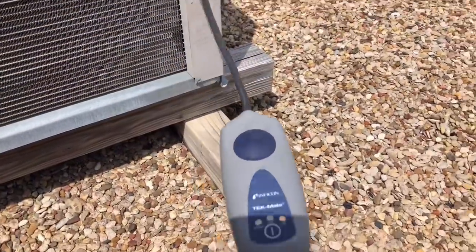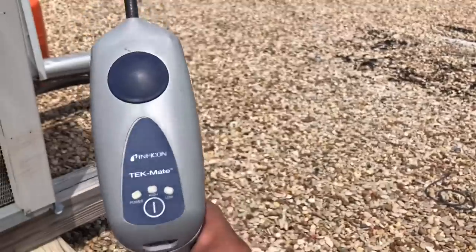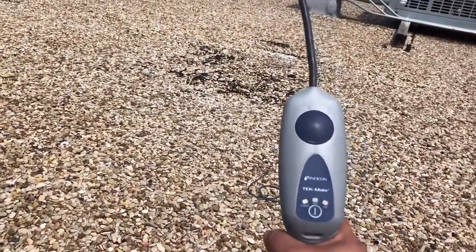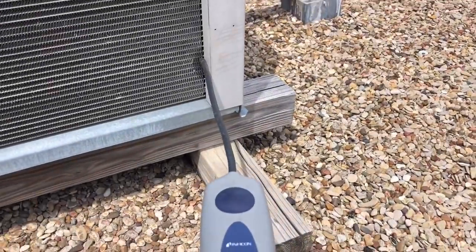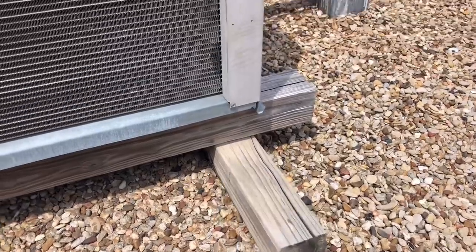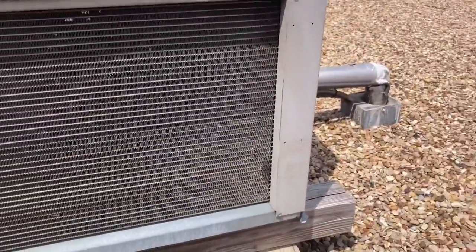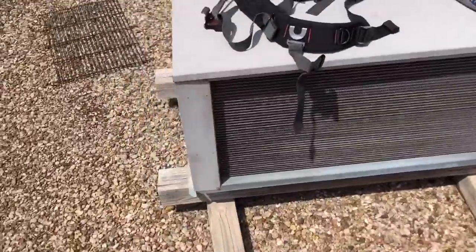There it is. It won't give you a PPM readout — it's not like the H10, but it's pretty smart. You pull it back, let it reset with fresh air, and then introduce it back into the leak. There it is. So we're going to have to get with the customer and see if they want us to replace the coil or replace the entire condensing unit — that's up to them.